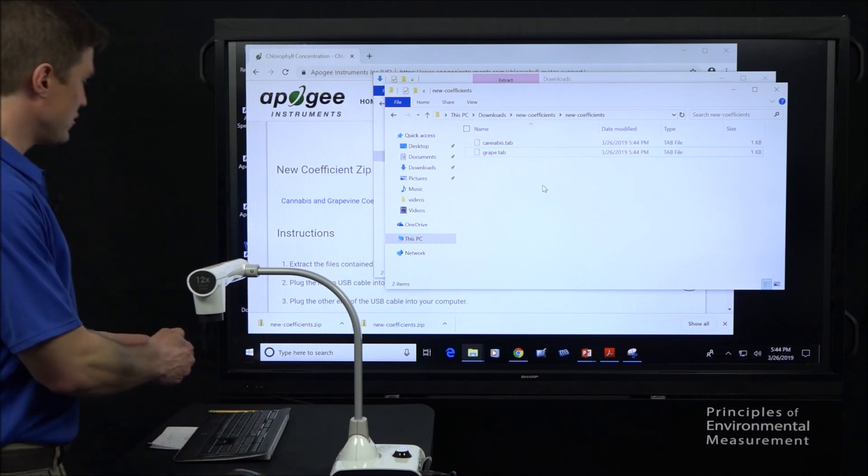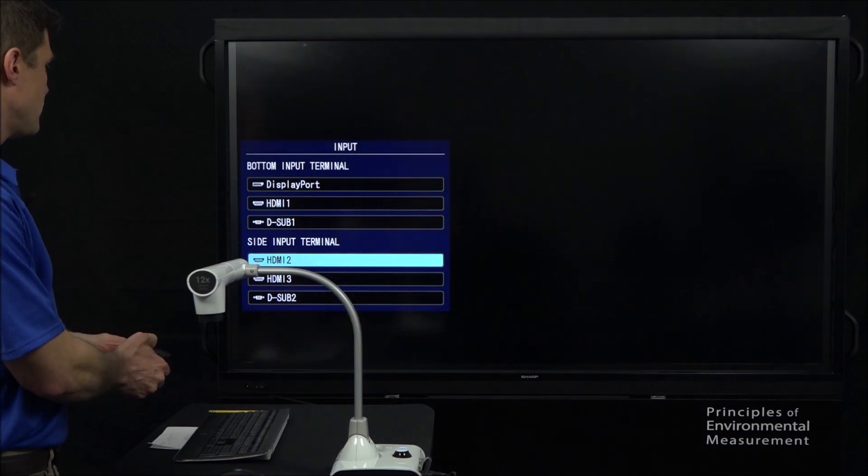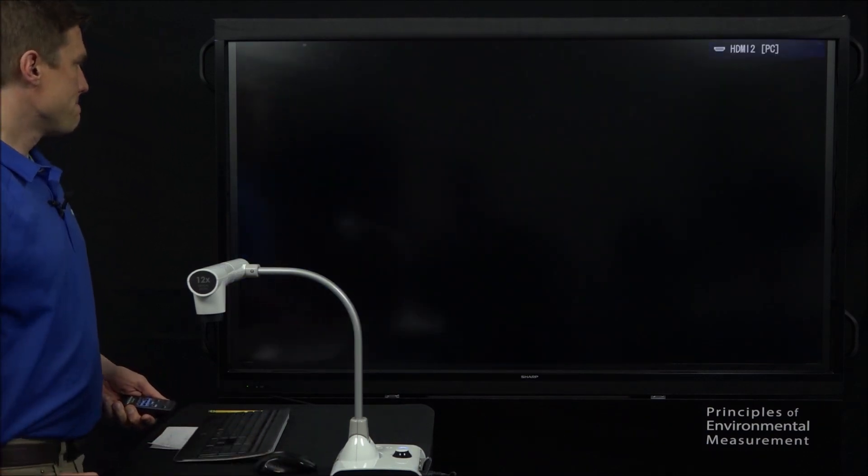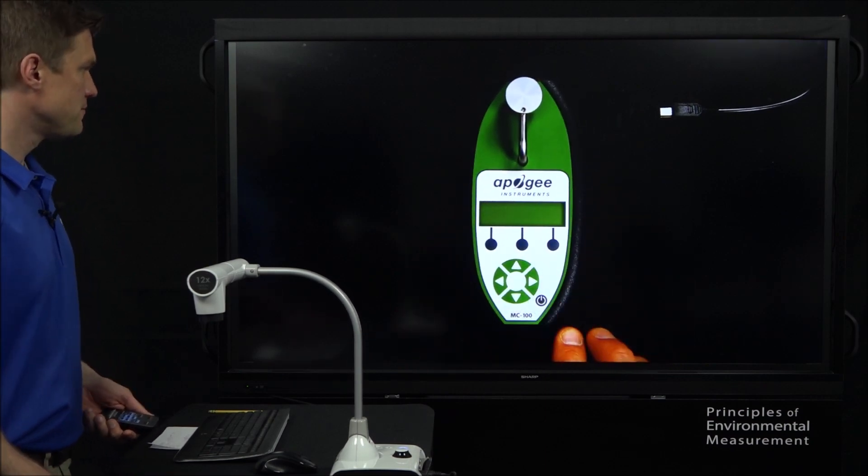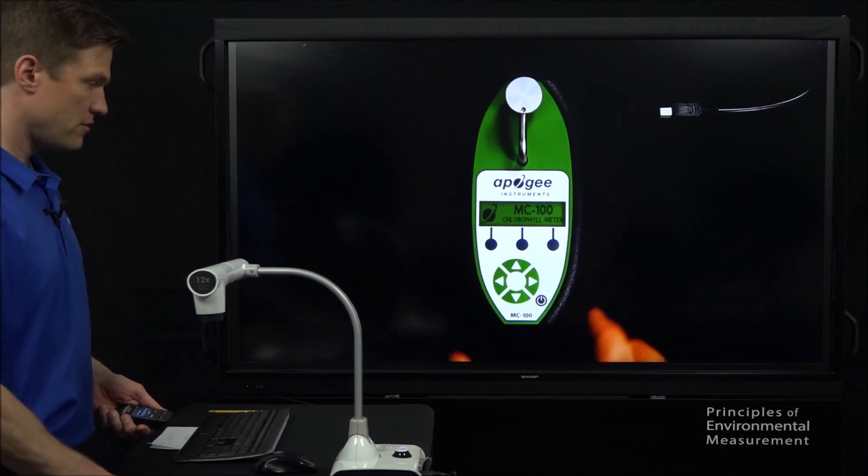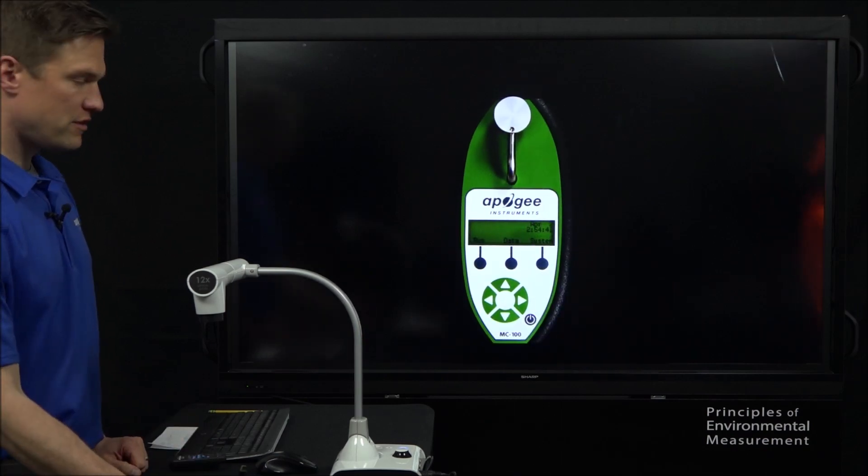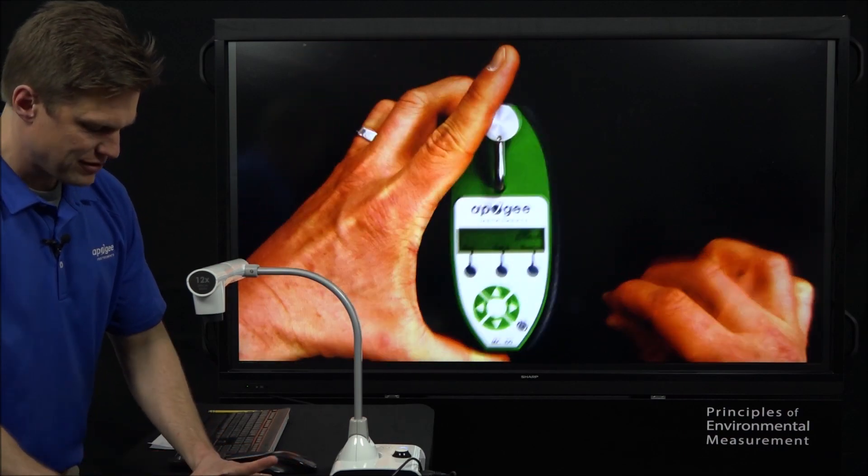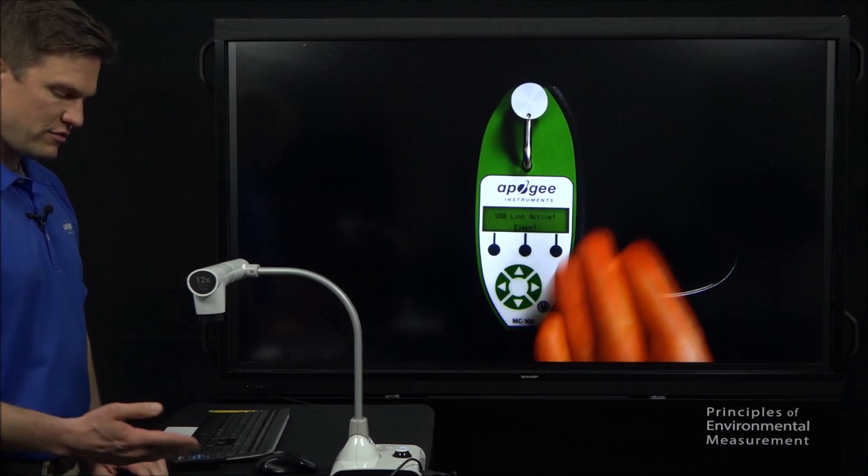So I'll quickly just move over to the display of the meter so you can see the buttons I'm pushing. So here's our meter. We'll turn it on. We plug it in with this little USB cable that it came with, the other end of which is in the computer. So now it's plugged in. You hit data and it says USB link active.